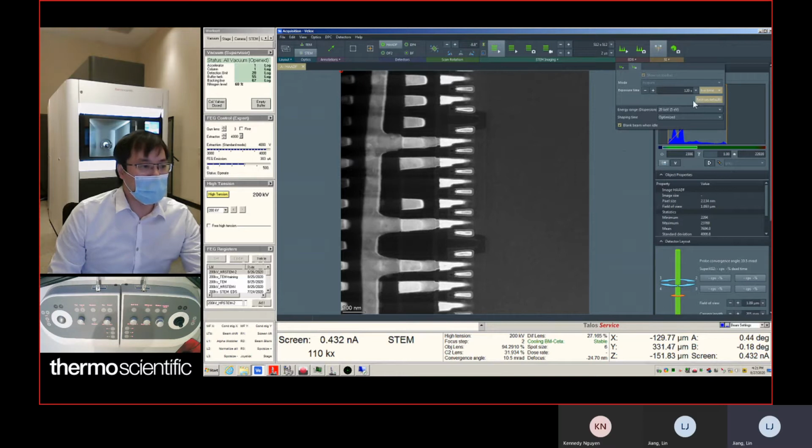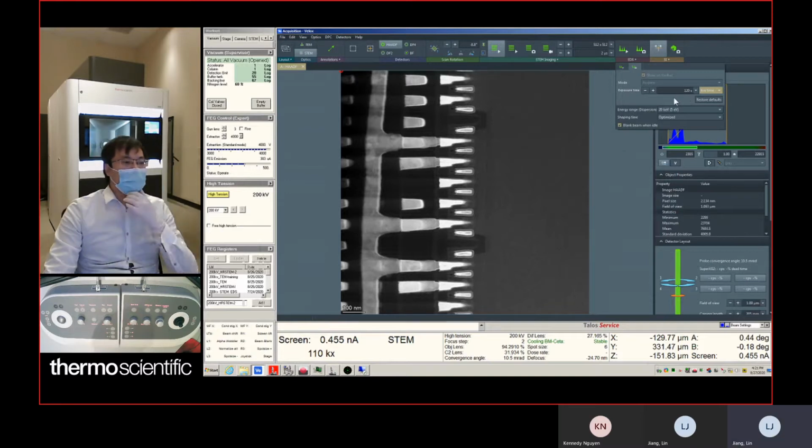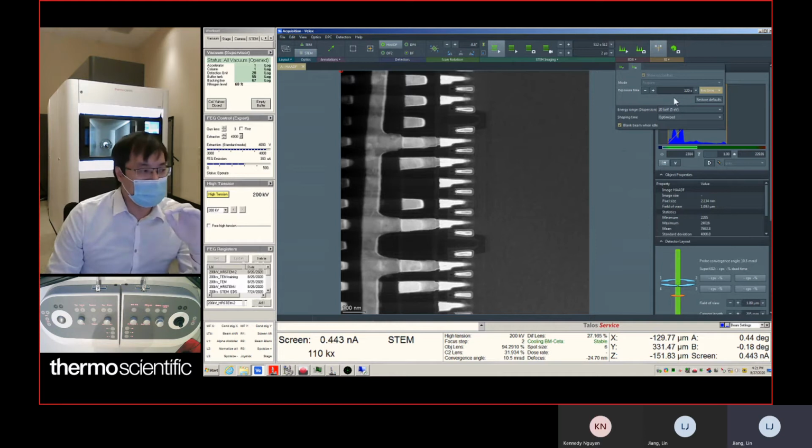If you choose live time, your exposure only includes the time the detector is processing the X-rays, not the time the detector is not processing the data. You can reset to defaults, so you can choose different ones. This is the highest exposure time, which gives you a better spectrum.